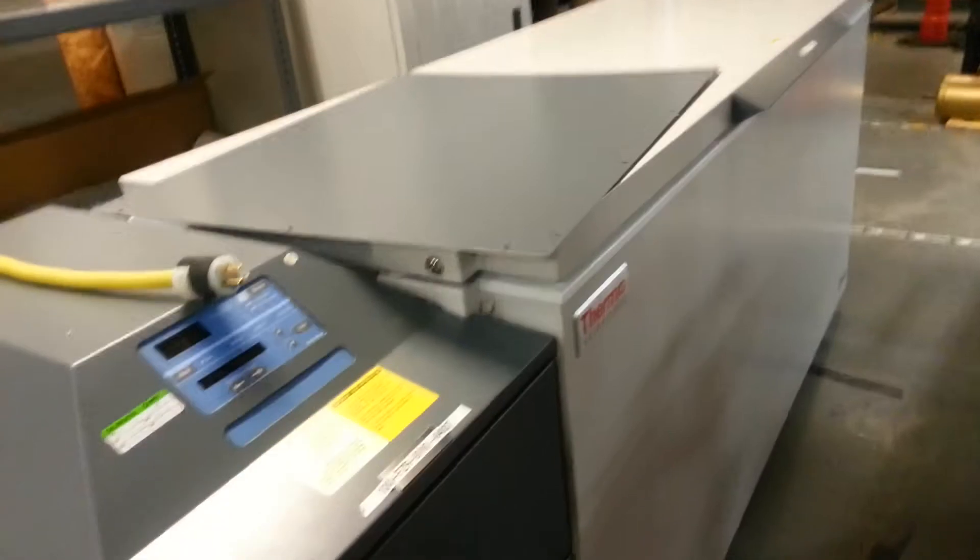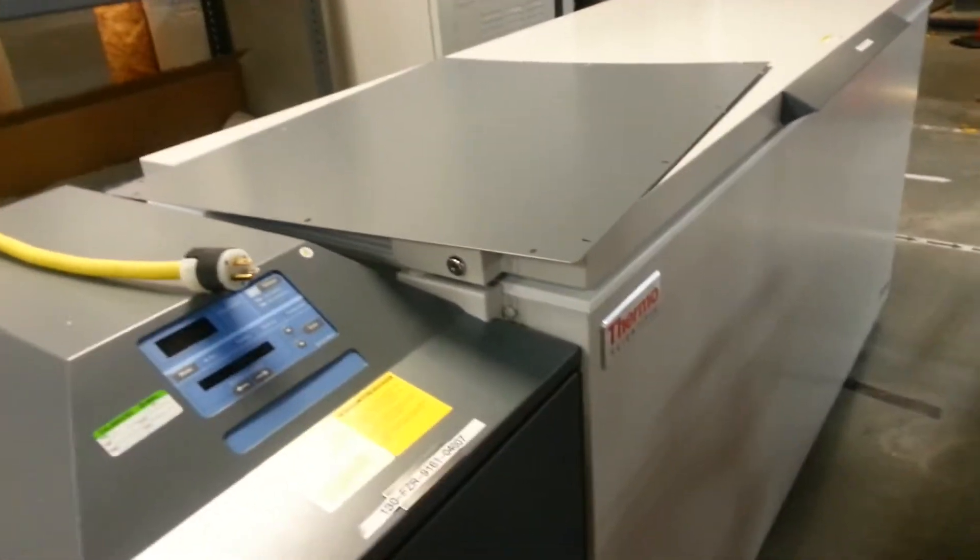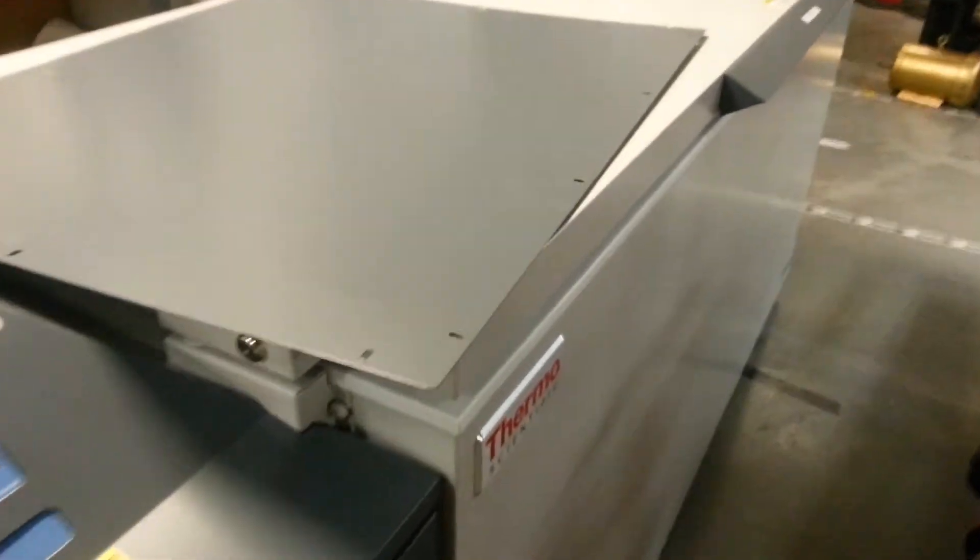This is a minus 80 freezer. We'll take this top off. This is used for laboratory use. This is the inside of the freezer.